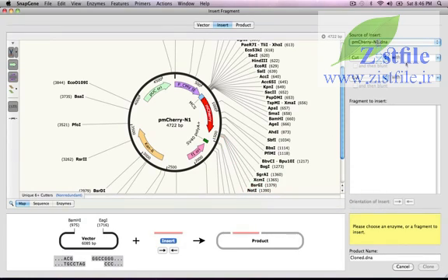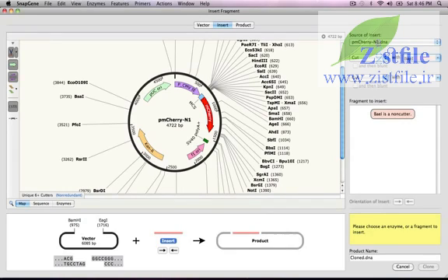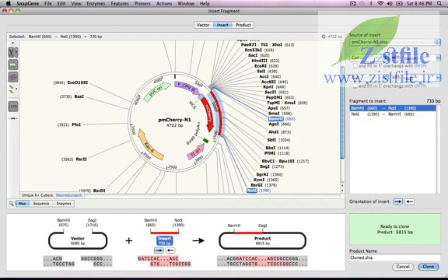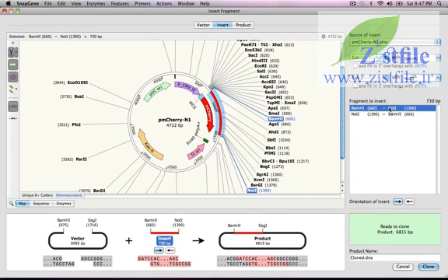Okay, let's proceed with the cloning. To choose the enzyme sites, I'll type BAM-H1 in the first entry box and NOT1 in the second entry box. Now the fragment I want is selected and is colored red in the map. If we look at the overview at the bottom of the window, we see that the sticky ends are indeed compatible and that the BAM-H1 and EAG1 sites will be regenerated in the product.